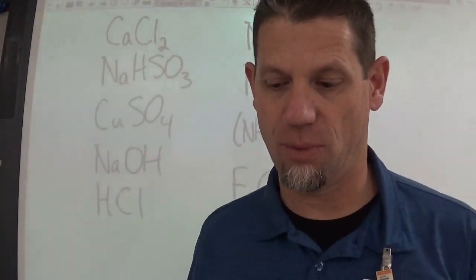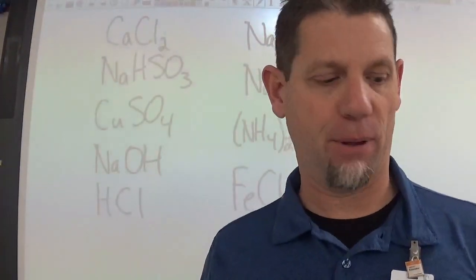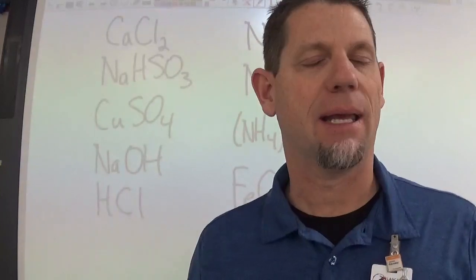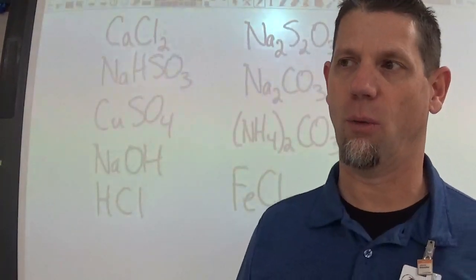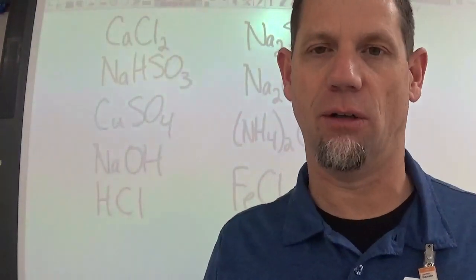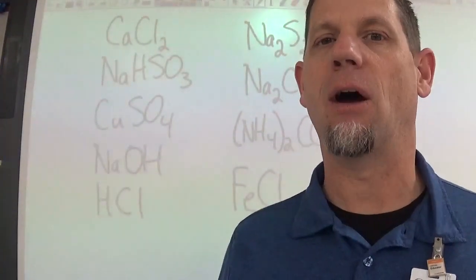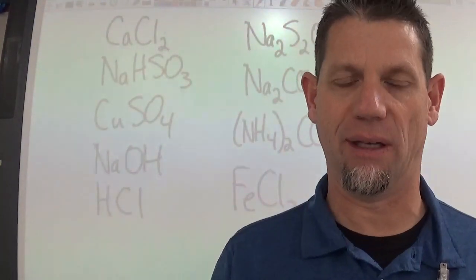The last thing I need you to be aware of is not all of these substances can go down the drain. The copper ions, which is the blue solution, it looks like this. When you use the blue solution, that little container can't go down the drain. The copper ions could be problematic to get into our water supply. So it becomes very important that the very first time that you go to empty your little spot plate, you make sure that the copper part, the blue part, gets into a waste beaker instead. Now, if a little bit gets down the drain, it's not going to be a big deal, but we don't want a lot of this stuff going down the drain, all right?